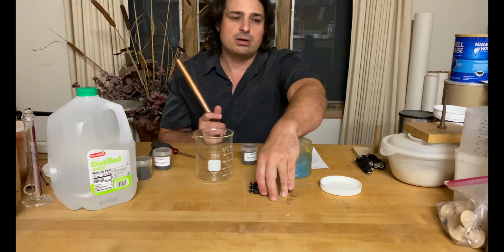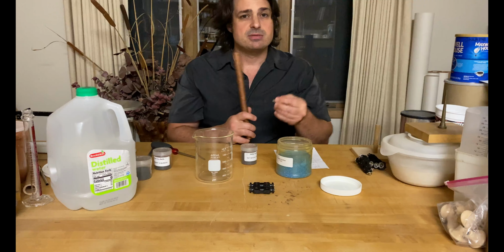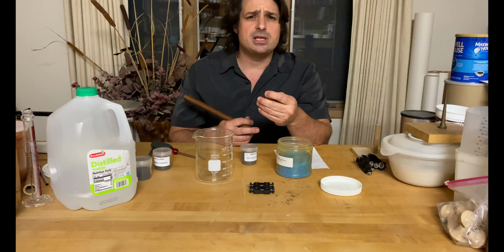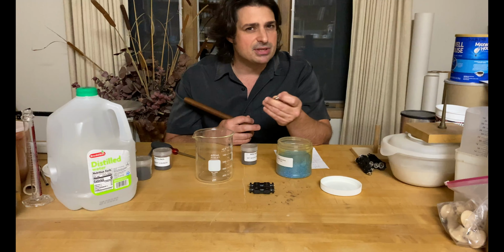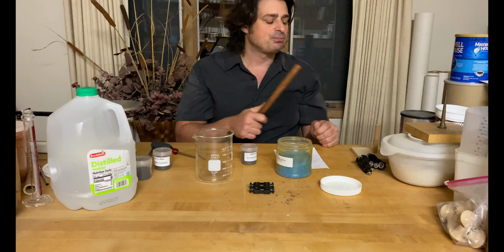When there's no motion, there's not much of a reaction, right? But magnets will always react or attract to the three elements: cobalt, nickel, and iron. So these are the ferromagnetic elements, but really all elements have some delicate interaction with magnetism.